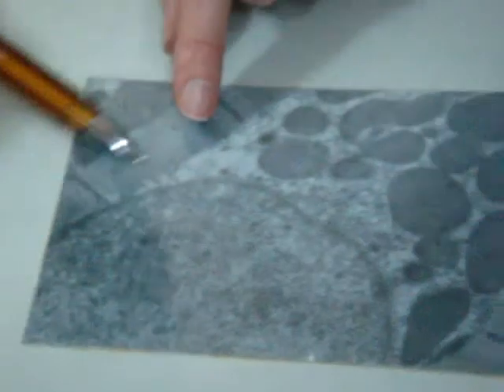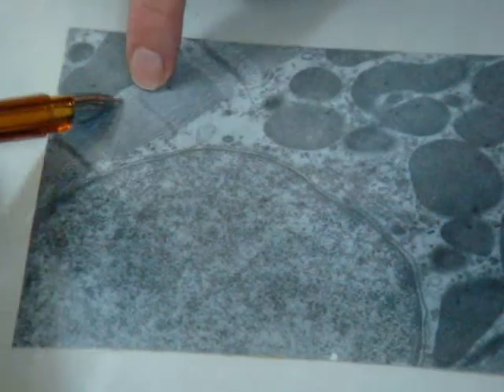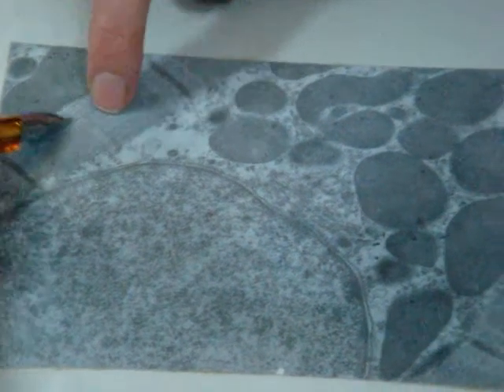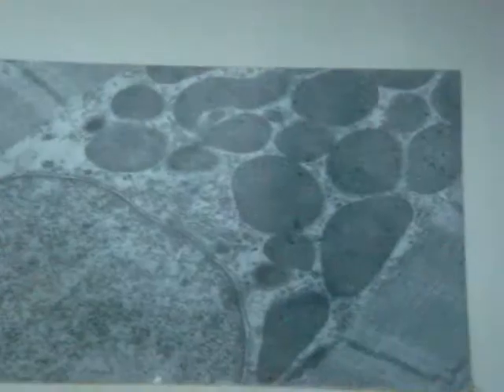Here the thick and thin filaments cross, so it is dark enough. In this portion, where only the thick filaments are, it will be a bit lighter. This corresponds to the H band. And all thick filaments are held together at this M line by myomesin protein. So, no question about this?